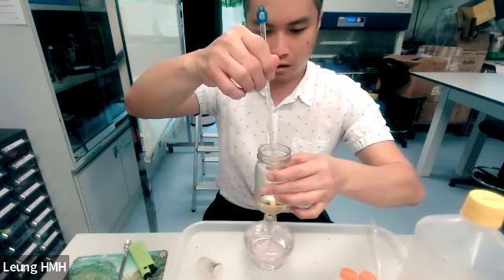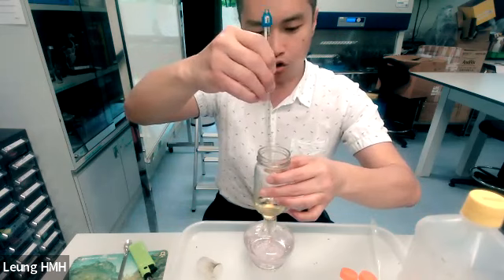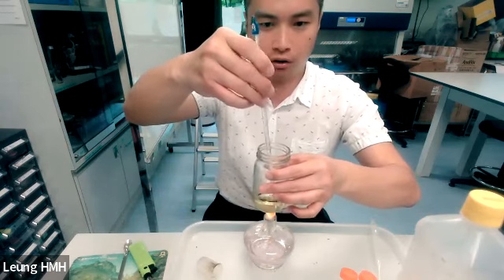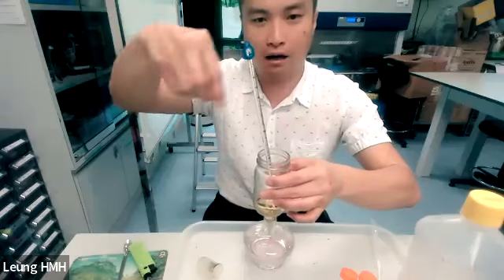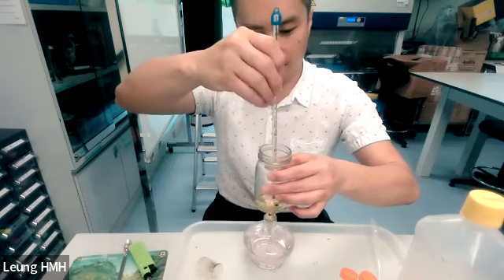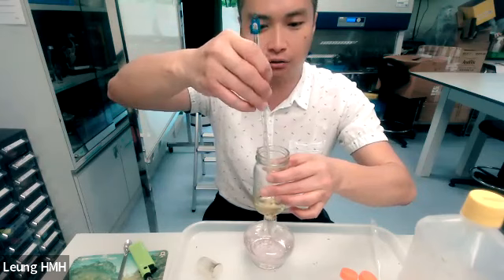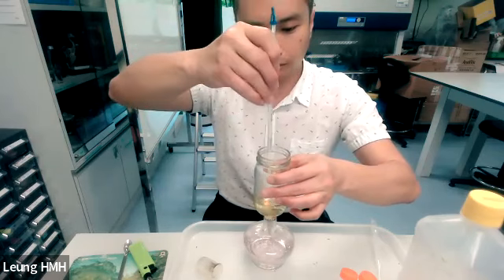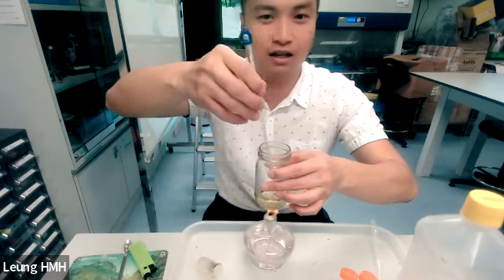When we try to heat up the solution, please pay attention. We need to stir the solution. Actually, we have a stirrer to stir the oil, but I'm now using a thermometer. It's not good common practice, so please don't try to learn this, because I haven't got a stirrer.